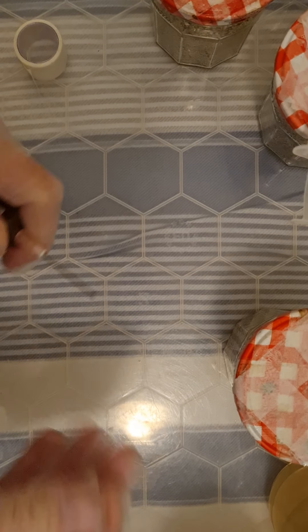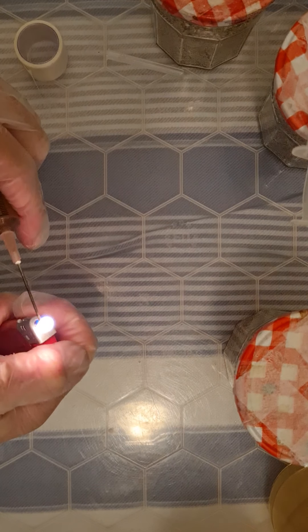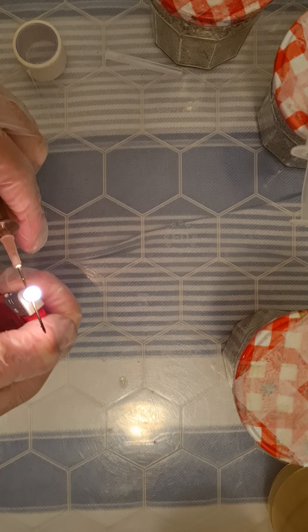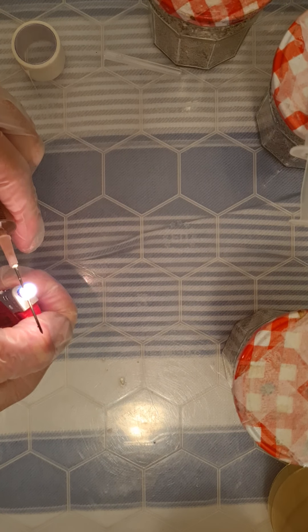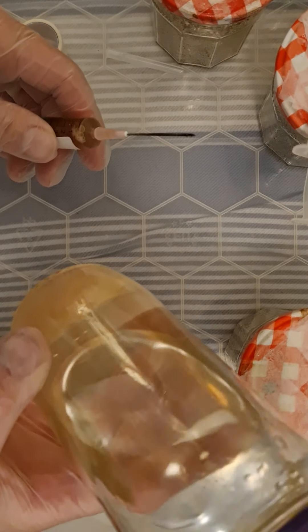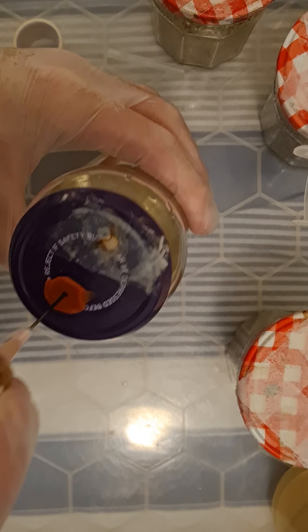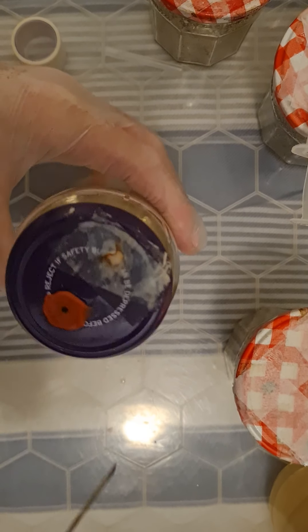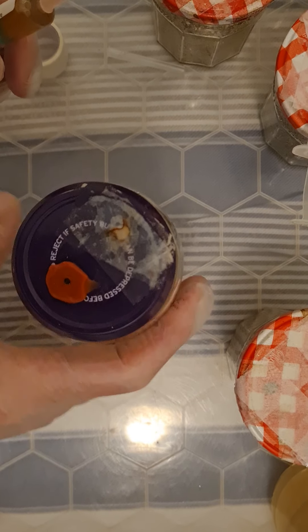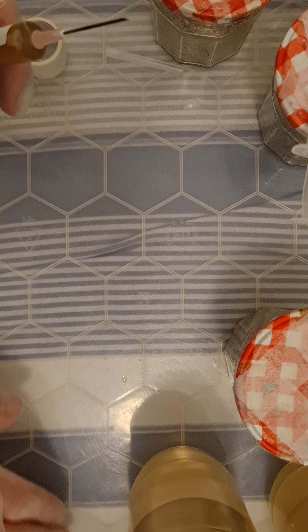Also, while I've got this one out — because I know it's already a strain I want to keep — I'll inoculate a liquid culture jar. It'll grow out some more mycelium. There'll be a tiny bit of mycelium floating around in there, and that'll grow out and then you can make more syringes from that.